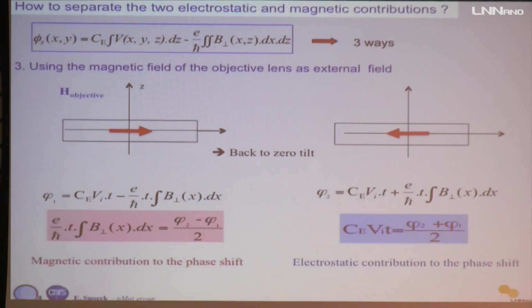The main problem is that when we are dealing with very tiny nanoparticles, which is most of what we do, if you make holograms on the material where you have located the interesting particles, or you take a lot of particles, and then you switch upside down and go back, you have to find the exact particles again. And you can spend days finding them. It is like the game where you have to throw bombs on the boats, etc. So you have to make a very precise map of where the samples are, and try. Sometimes you succeed.